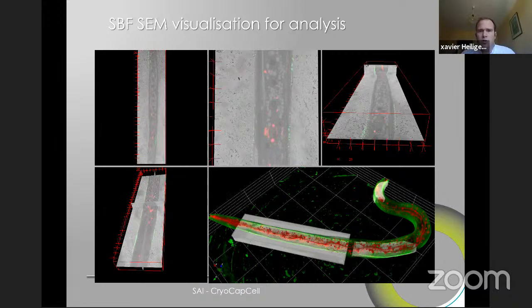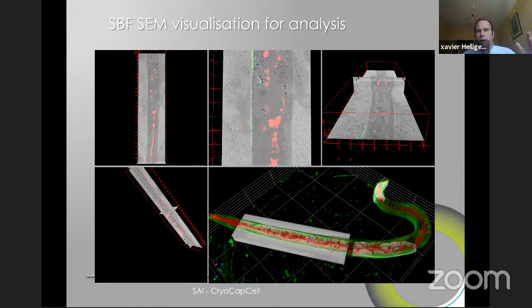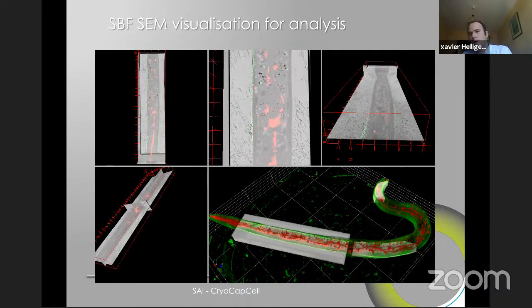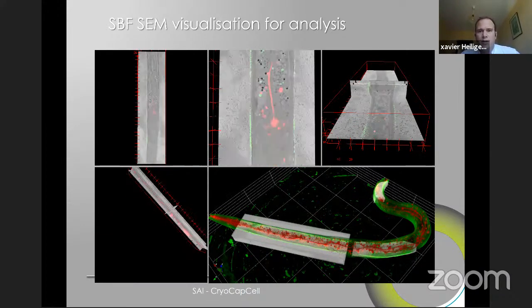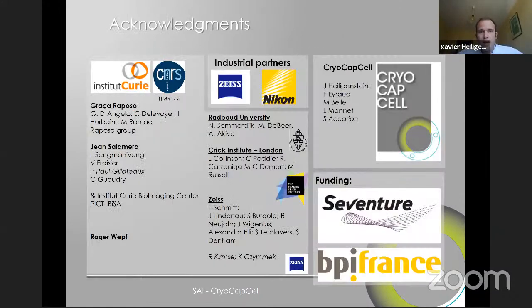So you can do live cell imaging, high pressure freeze, do cryolight microscopy if you wish, freeze substitute, light microscopy on the block again, and then do electron microscopy and have all of this with high contrast and high quality without any compromise. And so with this, I'd like to end my presentation.